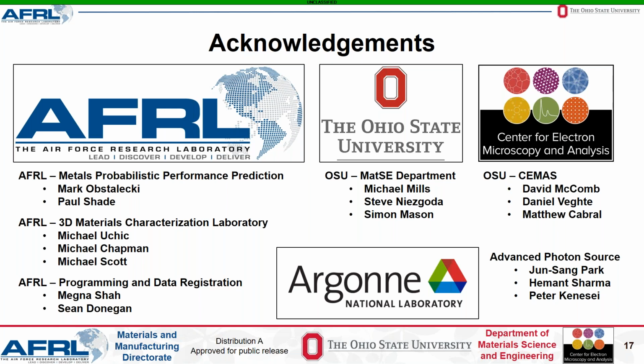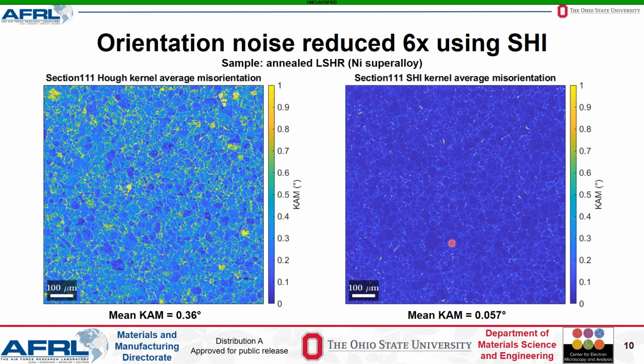And then when I run it on, say, let me pull up the previous slide here. So like here, this is essentially a randomly oriented polycrystal. And in terms of the noise, it doesn't seem to cause any huge issues when the orientation of the crystal being indexed changes. If you look closely, you can see a slight effect near grain boundaries where you start to get pattern degradation from more than one pattern being generated from the same interaction volume. Does that answer your question?